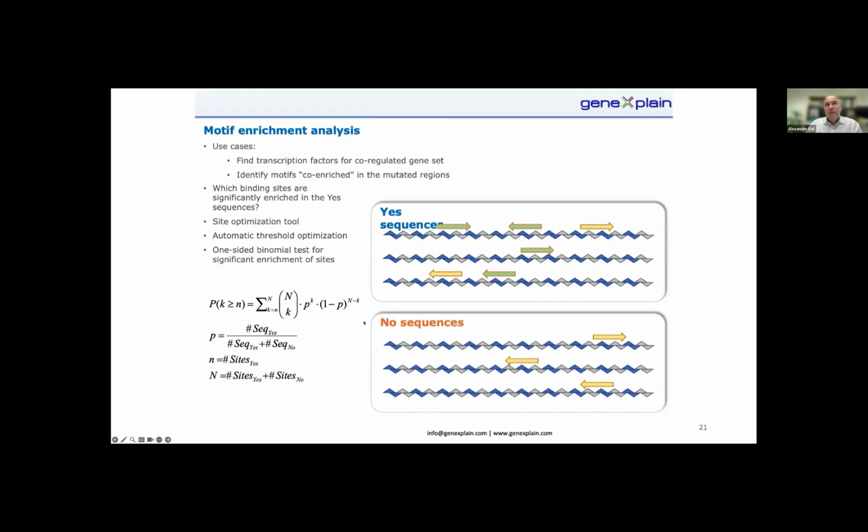And here we have a formula. What it does actually is this important thing which is called enrichment. Why do we need this? So what is enrichment? You actually see that these genes are upregulated, which means they have in their promoter something which is not here. Or maybe they have this something in larger amounts. So as you can see here, 3 of these genes have this green site, but none of these have it.